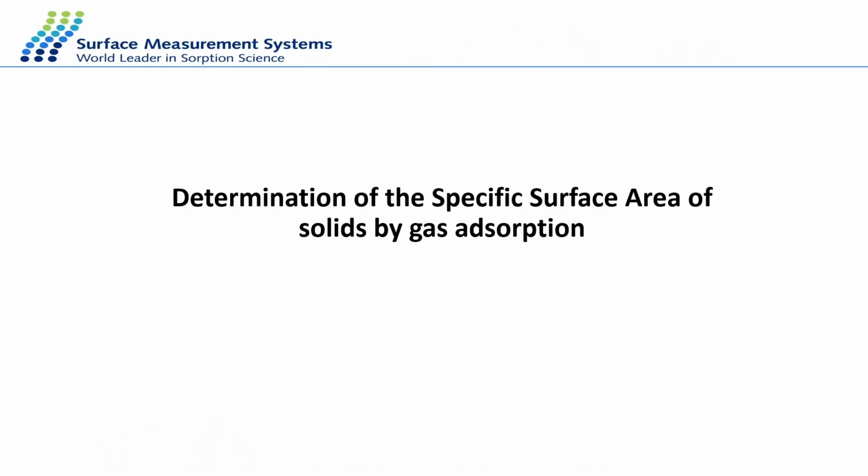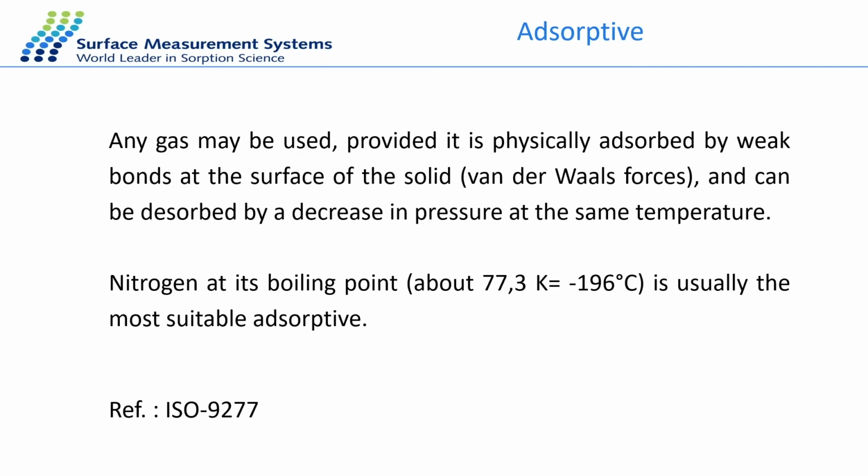First, the BET specific surface area analysis of solids by gas adsorption. To apply the BET method, you have to measure a gas adsorption isotherm.